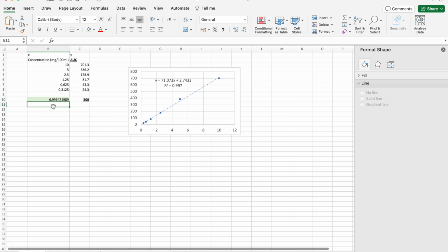Okay, so it's a really useful technique that allows us, with an experimental system like the UV spectrometer or an HPLC, where we're going to get an experimental value of an area under the curve, or an experimental value of absorbance, which doesn't really have any meaning to us, well, we can then give that value a meaning by constructing a calibration curve.